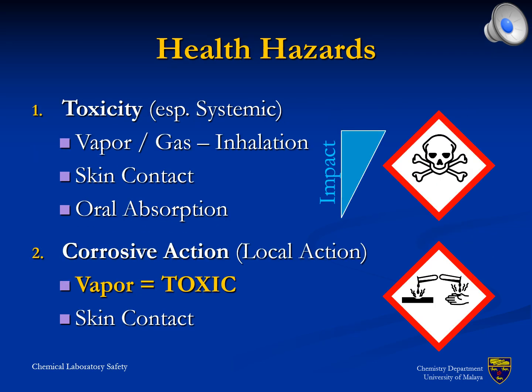Health hazards refer to different levels of toxicity. The systemic toxics immediately affecting life are characterized with a skull. Locally acting chemicals are typically labeled as corrosive. The impact of a toxic depends on the route for the exposure. Attention should be particularly directed towards intoxication via inhalation and upon skin contact. Such chemical hazards require special precaution for safe operation inside the lab.